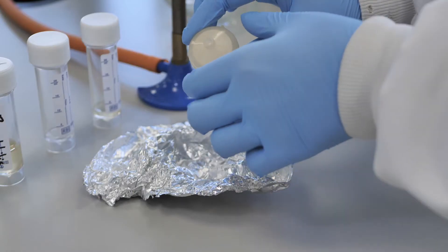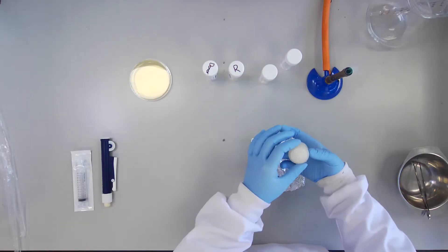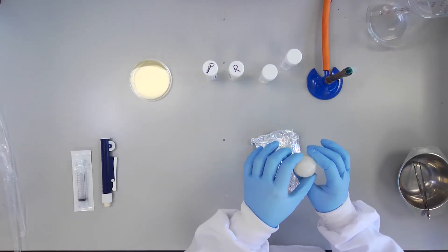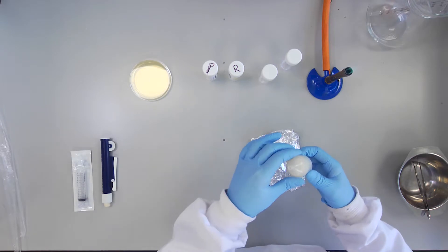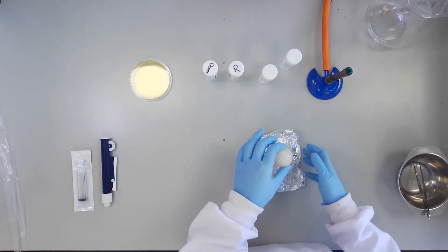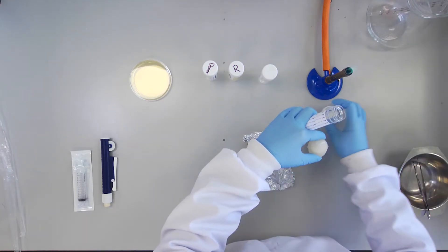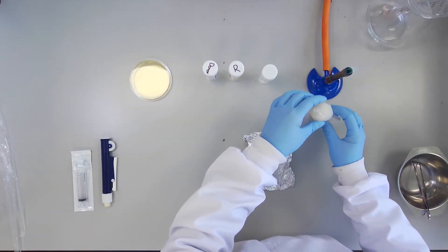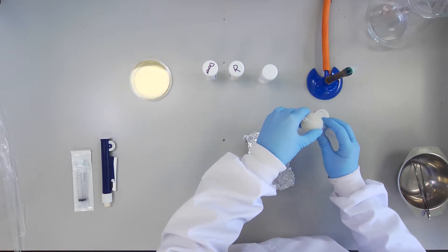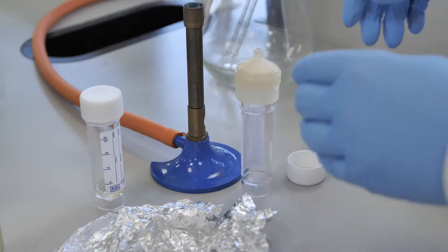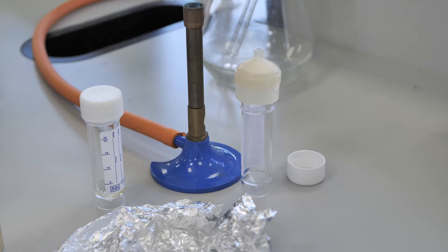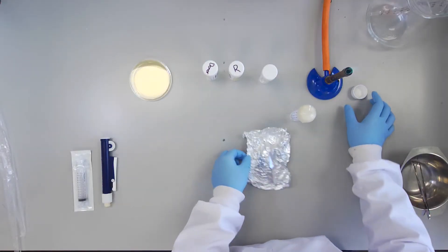Tighten the Swinex filter to ensure there will be no leaks when performing the filtration. Position the Swinex filter on top of a clean universal container. Retain the tin foil for later use.